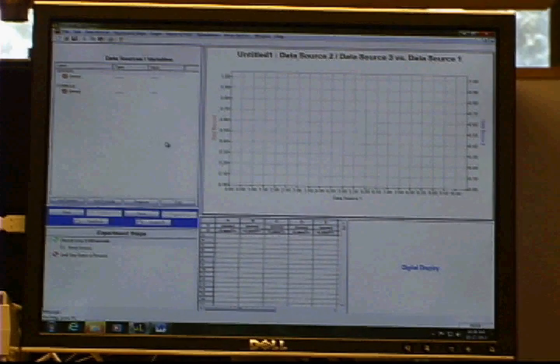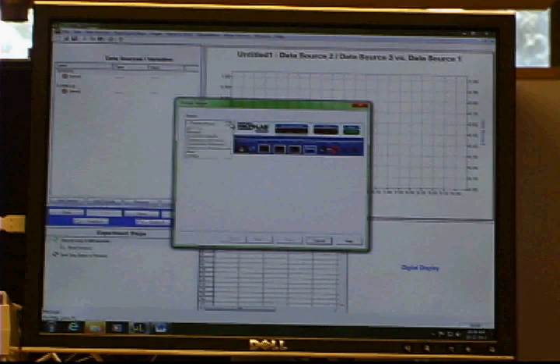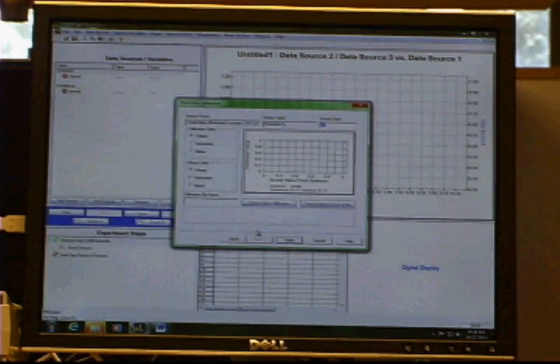After opening the Microlab software, we'll get this main screen that appears. The first thing we need to do is add two sensors. We're going to be adding a thermistor sensor and a time sensor. So if we go in here, add sensor, and we're going to first add a thermistor. So we come down to temperature and thermistor. It's currently plugged into the A. So we click that, and then we click next.